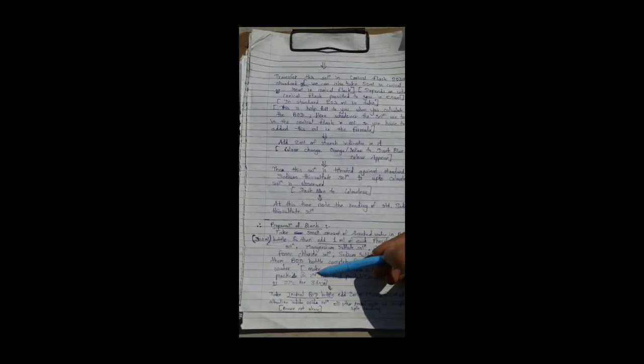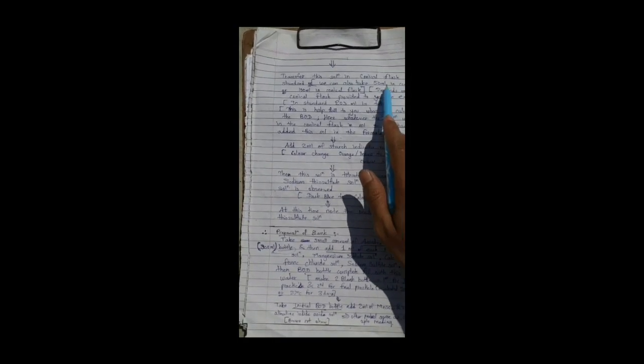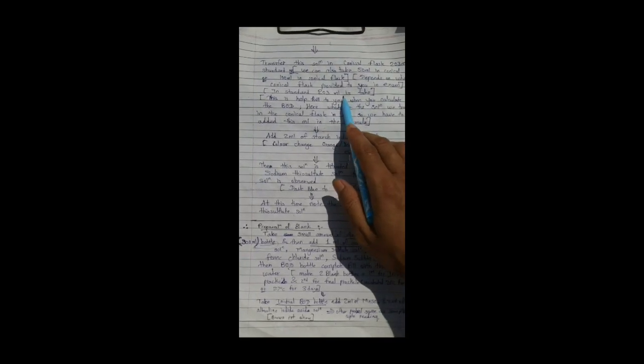So after the addition of the reagents in the sample and the blank, we have to transfer the solution to a conical flask. The standard is 203 ml, but we can also take 50 ml of the sample BOD bottle into a 50 ml conical flask, or 100 ml into a 100 ml conical flask. It depends on what conical flask is provided to you in the exam. In the standard, you have to take 203 ml.